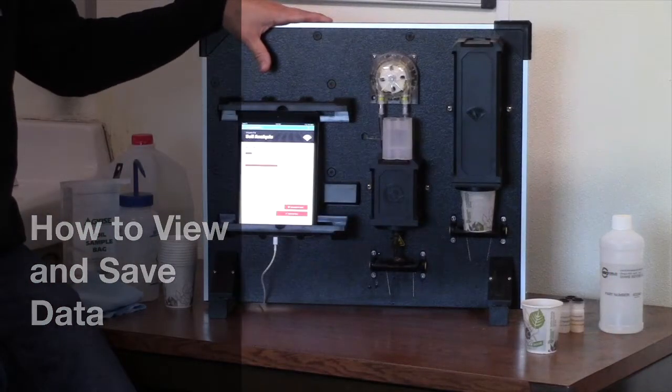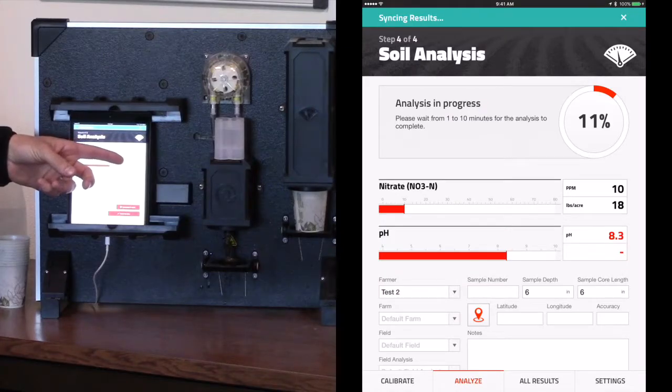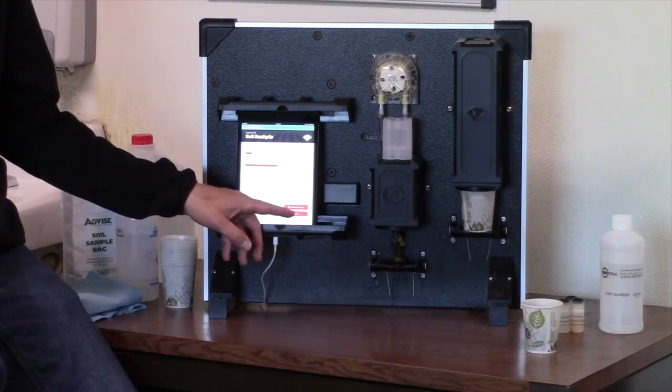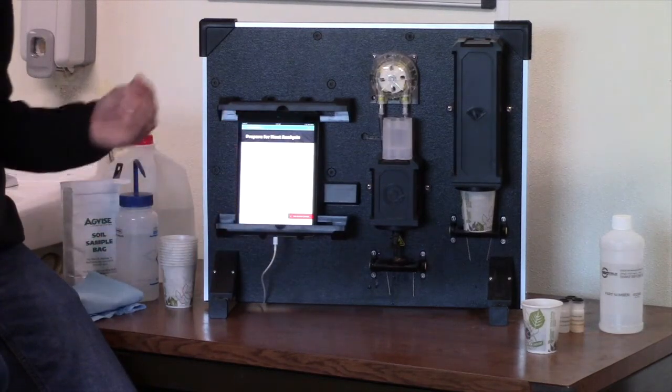After your 360 soil scan is done taking its reading, you will see the data displayed in the iPad in the top right corner. As you will see, it displays in parts per million or pounds per acre. We can then save these results by clicking Test another sample, which then brings us back to the first step.